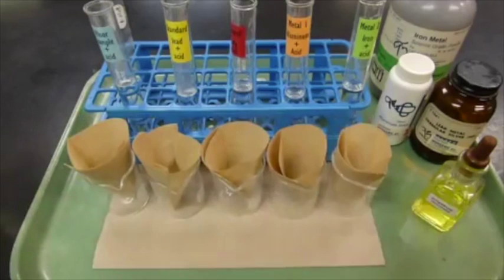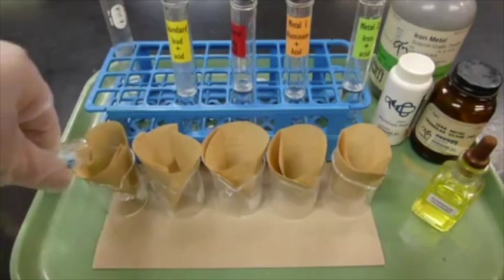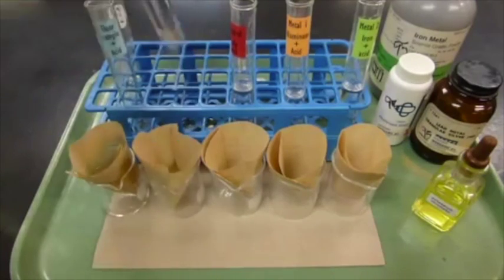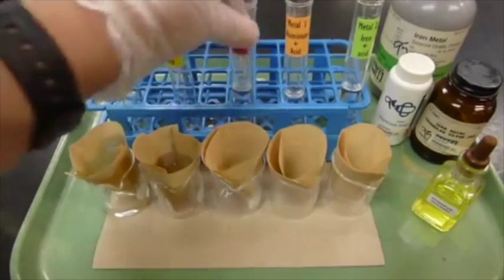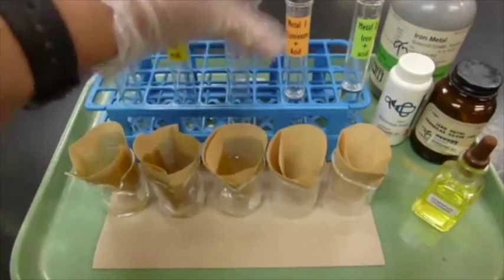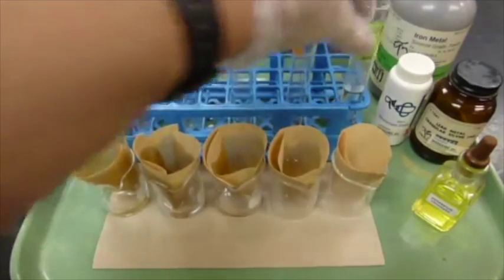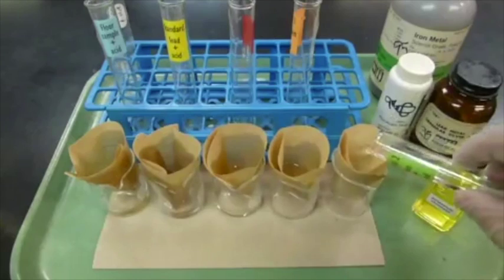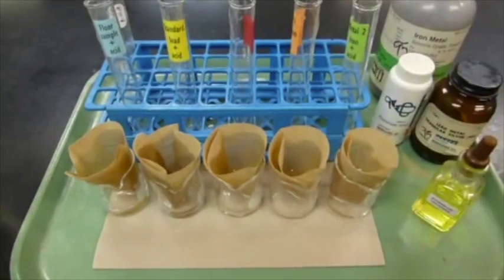I boiled the samples in acid like we did, and I'll pour them through the filters, and instead of cups I'll use beakers so that you can see what they look like when I add the chromate. Now what we're looking for is evidence that the results that were obtained indicate that there's lead in the sample that came from the floor. We want to rule out any alternative explanations for what we observe.